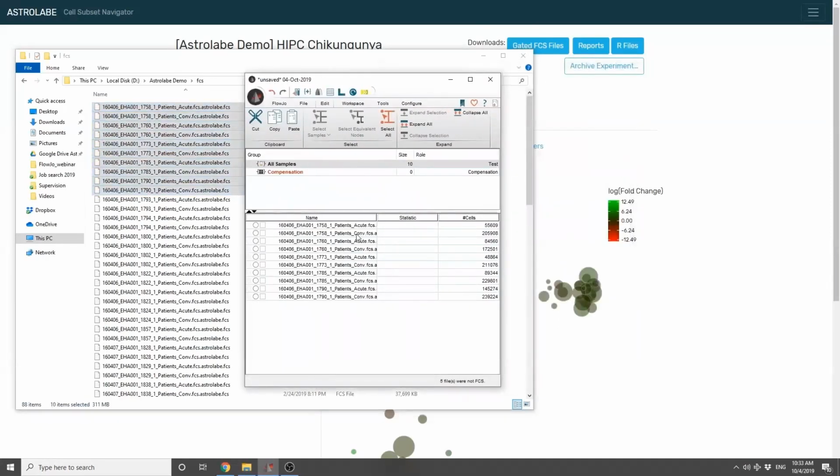So before I continue with FlowJo, I will say 2 things. One, I think every person has a bit of a different style on how to use the software. So whatever I'm doing, you might be doing it differently, and it can definitely be done in many different ways. And the second thing, when we just started working on this webinar, John and I, my idea was that I'll present the Astrolabe part and John will present the FlowJo part. And then John said, well, the FlowJo part is pretty easy, so I want you to do it. And then we had like a 20-minute conversation on what I want to achieve with FlowJo, and I really got a hold of the software really quickly. So I was pretty impressed with how friendly and accessible FlowJo was.